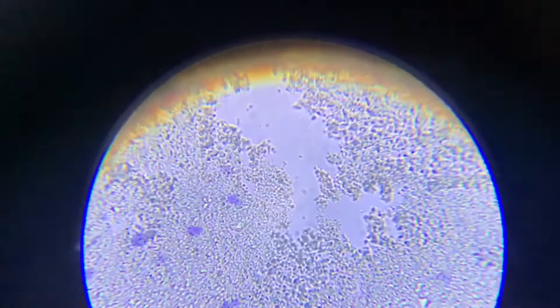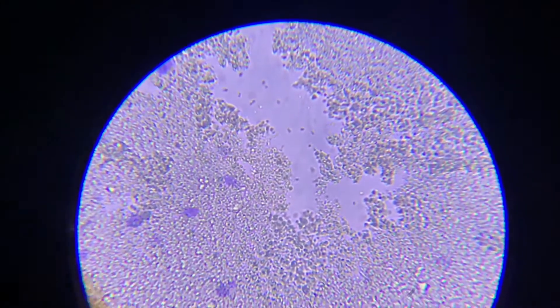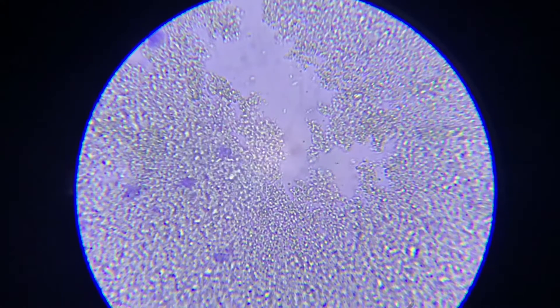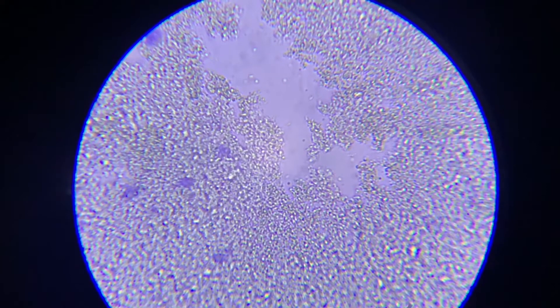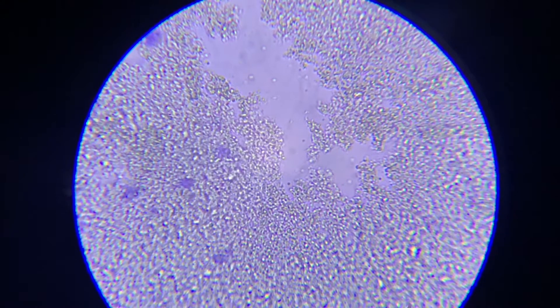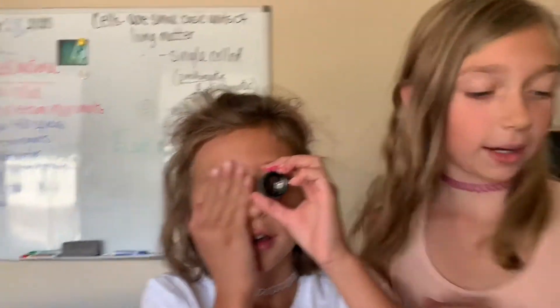Wow, how cool is that! Are you going to put that on YouTube? It means it has single cells and can live in extreme environments. Awesome! Daddy, this is a microscope — I can see you a lot! Oh hi grandma, excuse me, Daddy, I want to see!